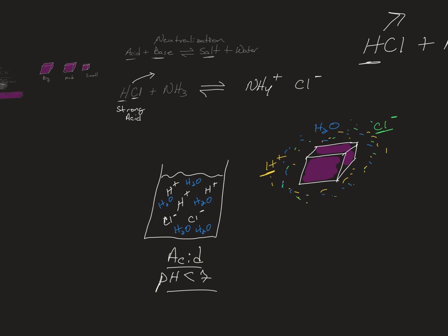But what happens when the ammonia in the gel is neutralized? The gel's going to change color from pink to what? To clear. Now you see the whole picture, don't you? Now you're counting the basketballs and you're seeing the gorilla. You see both. You can't focus on one part of the problem or you're not going to see the whole picture. That's the point.